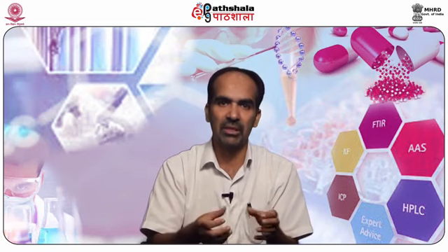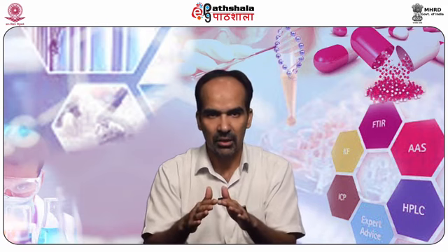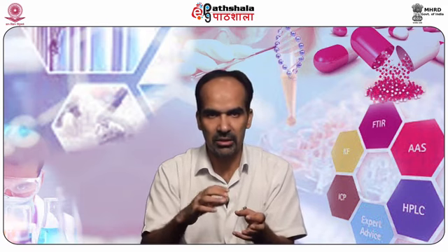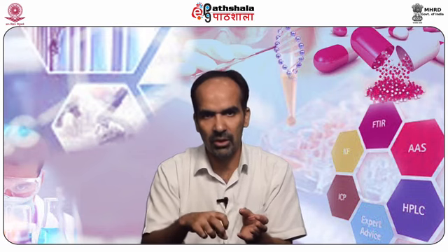One such method is enfleurage. You might already know this. Enfleurage is a method where we isolate the volatile oil based on the property of the solubility of volatile oils in fat.